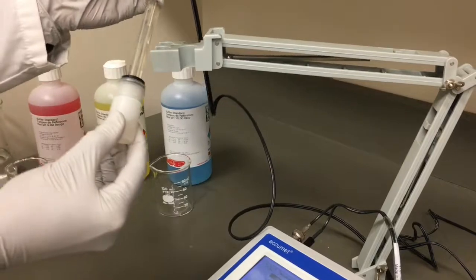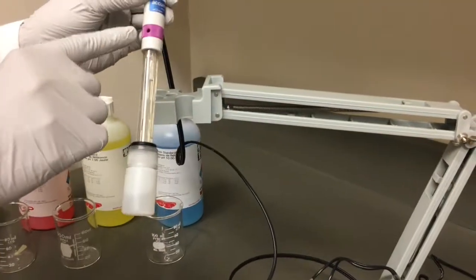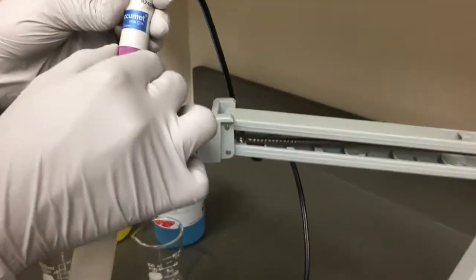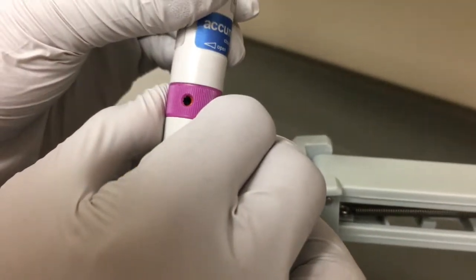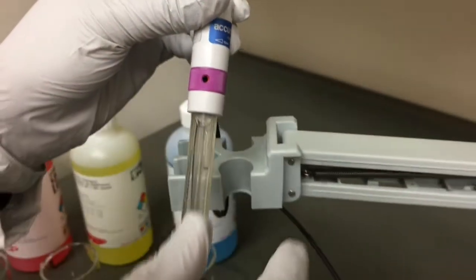The probe of the pH meter is stored in a high-salt buffer. If you have a refillable probe, locate the filling port and rotate until the port is in the open position. When stored, it remains closed to prevent evaporation of the filling solution.